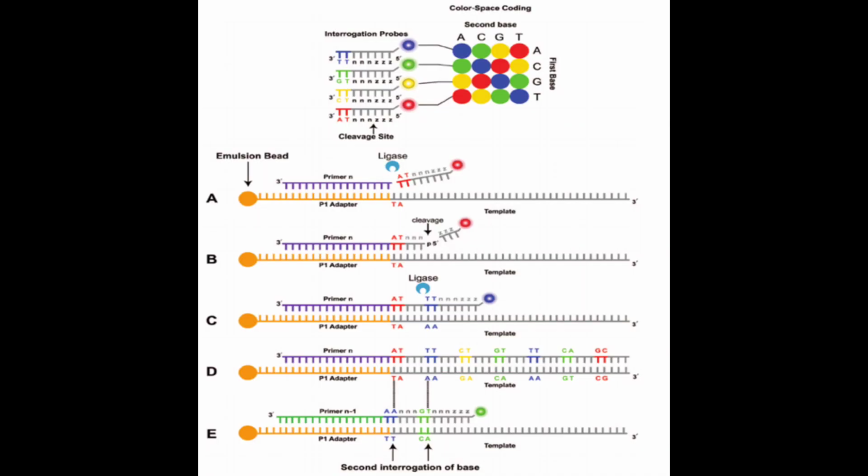Dari video tersebut bahwa pengurutan DNA adalah proses menyusun urutan bahan penyusun atau basa dalam uraian DNA. Sebelum kita dapat mengurutkan DNA, DNA tersebut harus dipotong menjadi potongan-potongan kecil yang dimasukkan ke dalam DNA plasmid dan kemudian dimasukkan ke dalam sel bakteri, memungkinkan untuk menghasilkan banyak sekali salinannya saat sel-sel bakteri berkembang biak. DNA kemudian diisolasi dari bakteri dan dikirim untuk diurutkan.